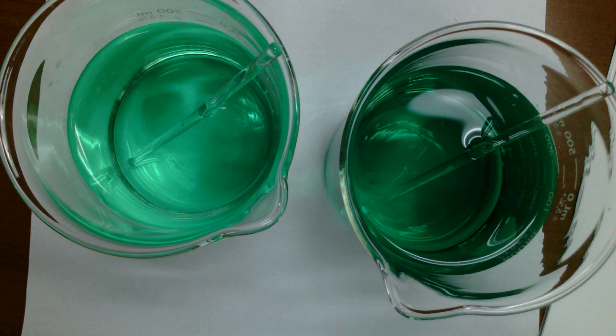Now, we can't tell by our eyesight. I couldn't look at this and say, hey, this is four times as concentrated, but we're going to use an instrumental technique for analyzing colored solutions of ASA and the iron complex that they form. And then we're going to compare that to our aspirin to ultimately get the calculation we need. So let me put this stuff to the side for a moment.